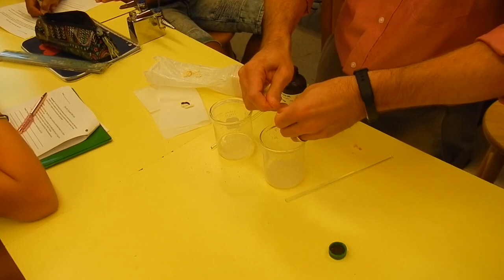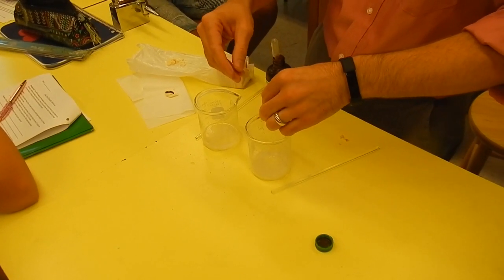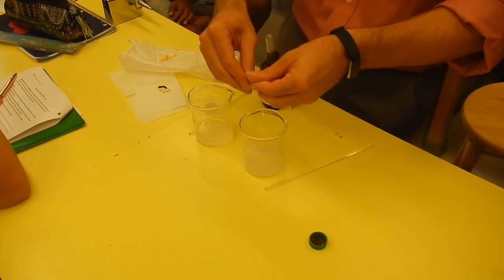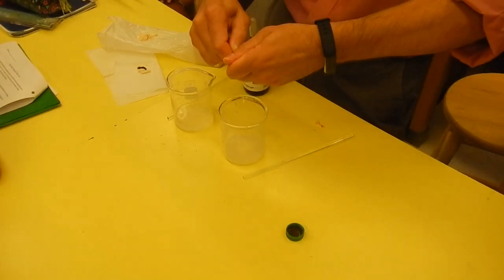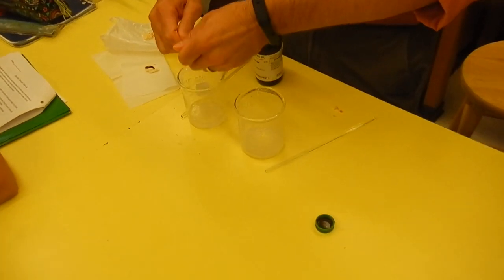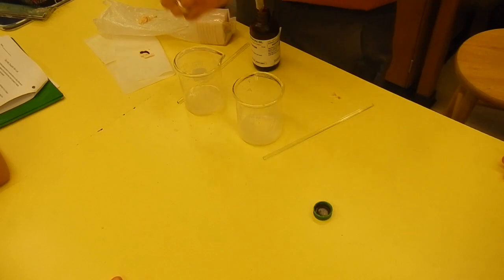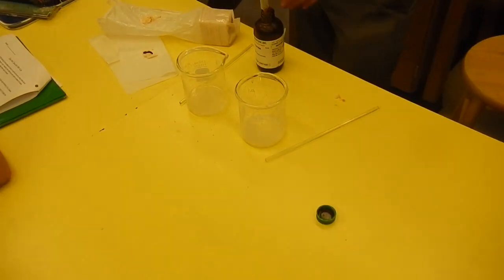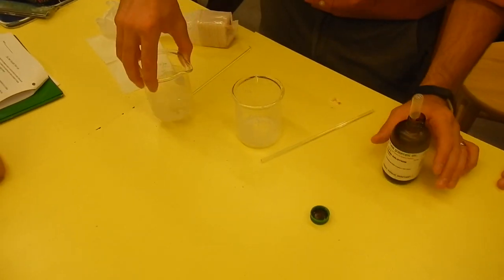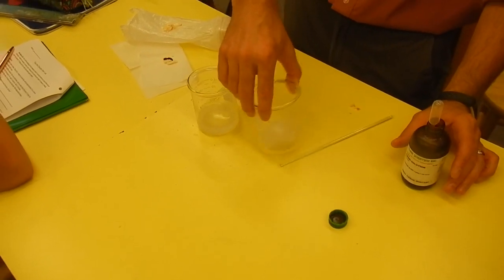Alright, so 9th grade, 10th grade, and 11th grade. I'm doing mechanical digestion, and I'm putting the saltine into this. I'm trying to make it as fine as possible, just like your teeth do. Now, for the magic of chemistry to work, we have to wait a few minutes. Why do we have to wait a few minutes? So that you can let digestion happen.